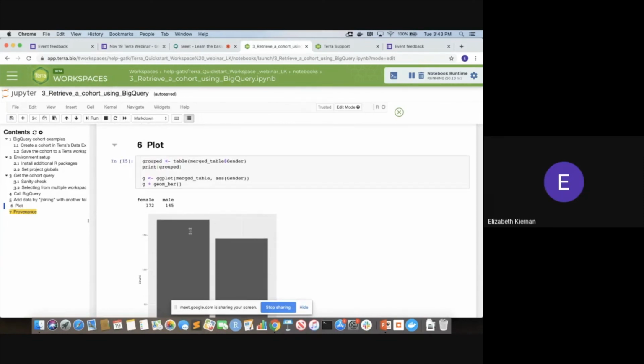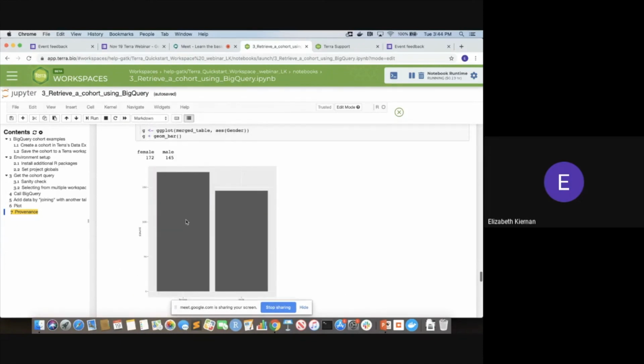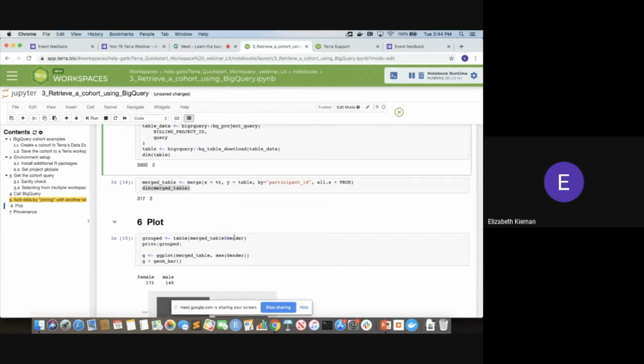As I mentioned earlier, I did want to show you how to change this from gender to a different field. The field that I selected for was population. So I'm just going to change this gender to population over here, and I'm going to make sure to do that everywhere else where I need to. I believe that would be these 2 places.